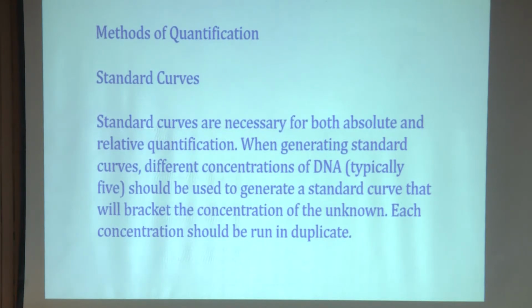So, the level of precise information which you want, you can design, and then you go for the preparation of standard curves. Of course, the kind of material which you are using for quantitation is also important. Suppose you wanted to quantify the material in a particular soil type, you try to use the same soil for preparing the standard curve. You should not use one soil type and then try to use it in another soil type, extrapolating them.